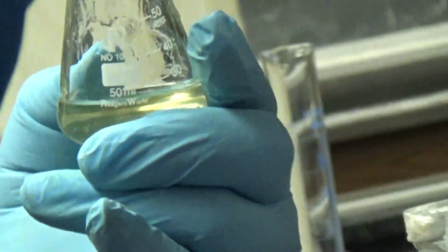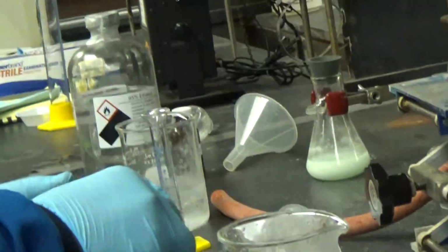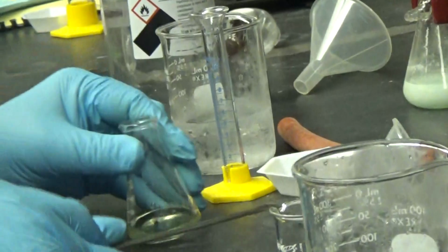Because that may affect the crystallization if there's some weird stuff in there. There's one more, I will take that out.